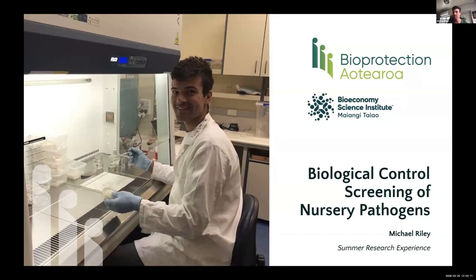Kia ora everyone, my name is Michael Riley, and over the summer I worked on a project investigating forest and nursery plant pathogens in New Zealand with a focus on Phytophthora and Colletotrichum species. In this project, I focused on an initial dual culture screening, testing different oomycete, bacteria, yeast, and fungi potential biological control agents against Phytophthora and Colletotrichum.